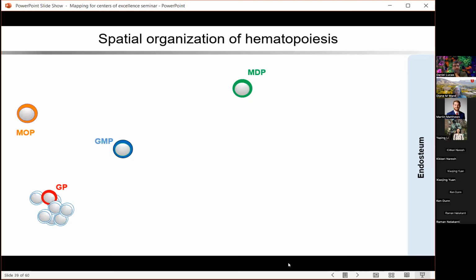So to try to summarize what we found, we know that these cells are evenly distributed through the marrow, forming clusters of granulocyte progenitors and preneutrophils. When the progenitor gets exhausted, another one comes in and continues differentiating.